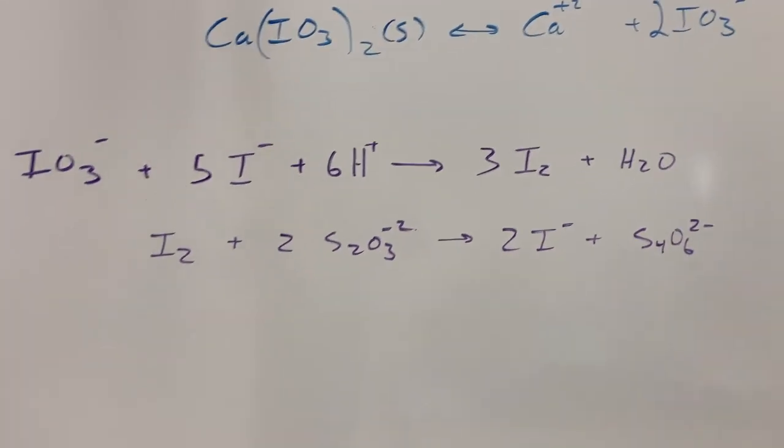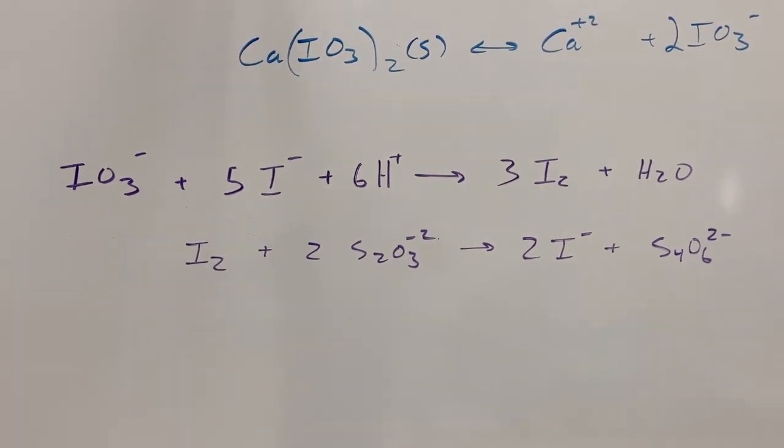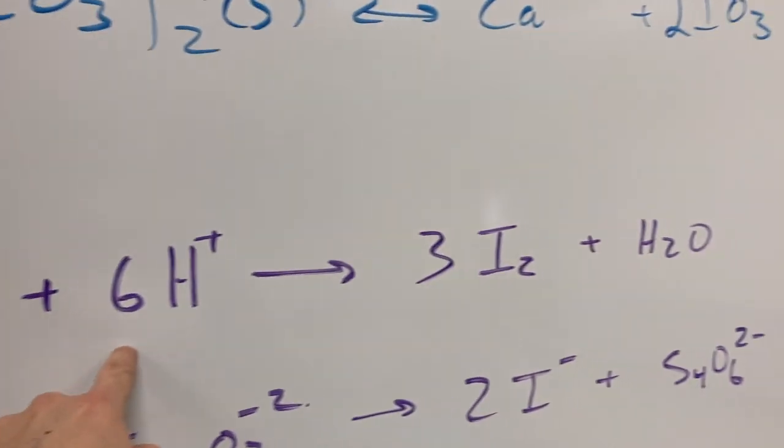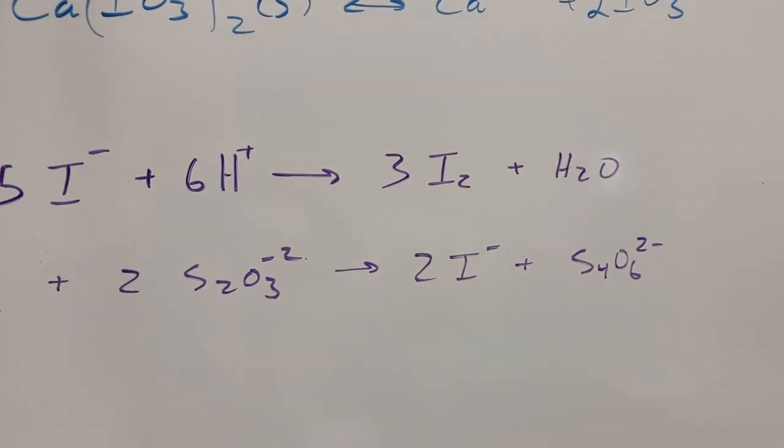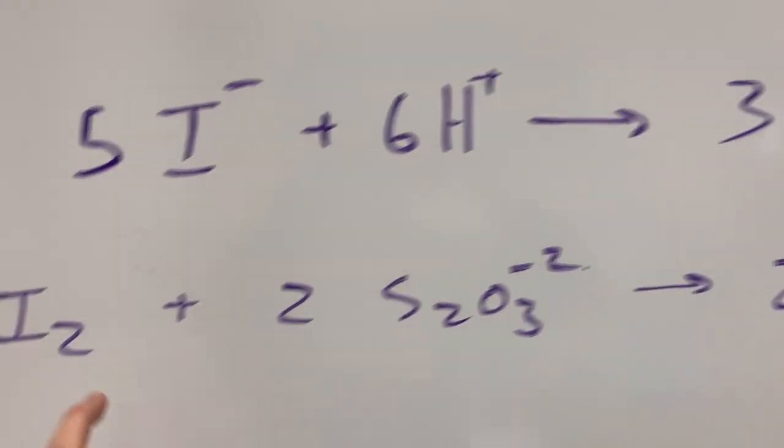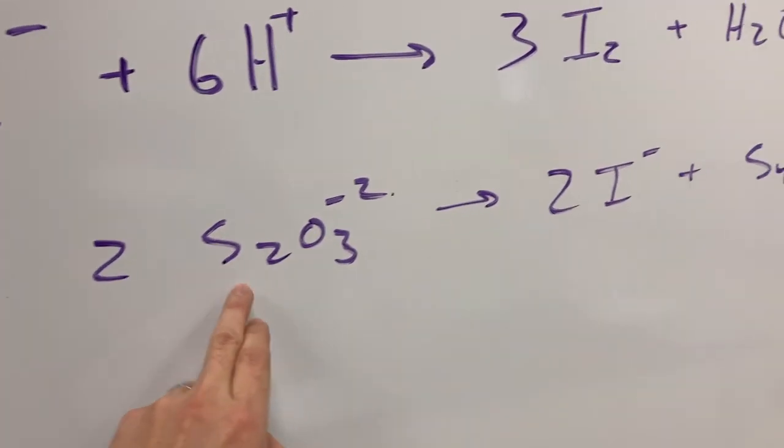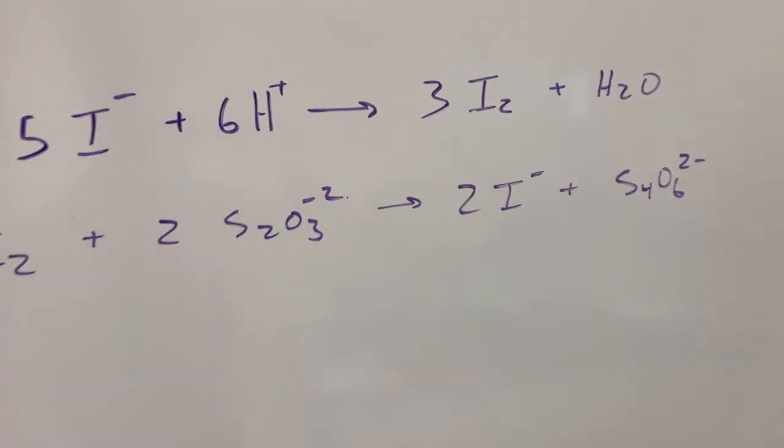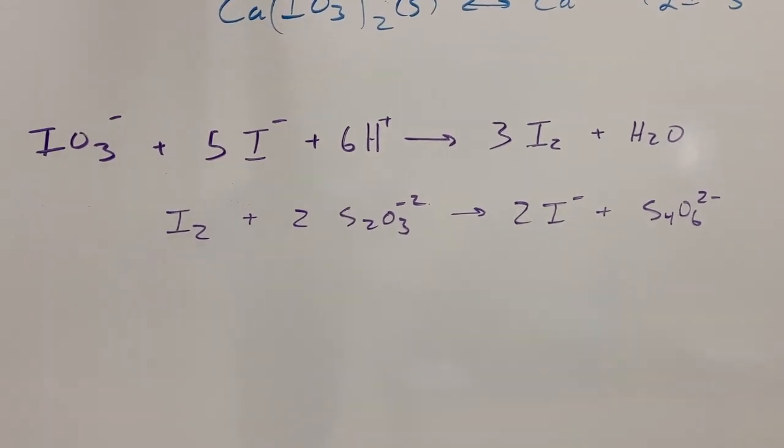The reaction that we're going to undergo is reacting the iodate with iodide and we have an acidic environment. This of course is a redox reaction. The formation of iodine as an intermediate will be consumed reacting with the thiosulfate to produce iodide, and once this reaction is complete there will be a visual indication so we'll know when to stop titrating.